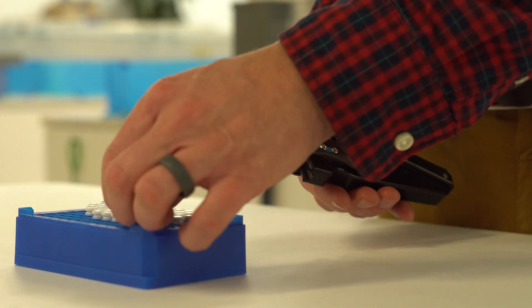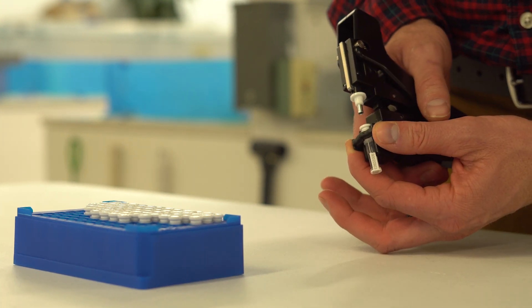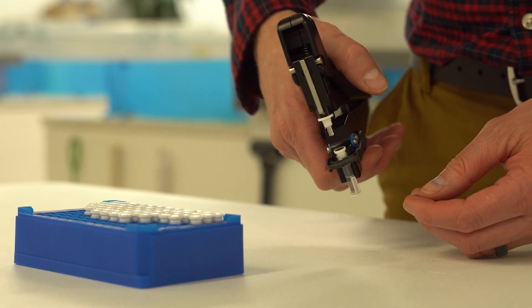Place a vial into the jaws with the aluminum top facing up. Secure the jaws around the vial. Depress the trigger smoothly to take a tissue sample.